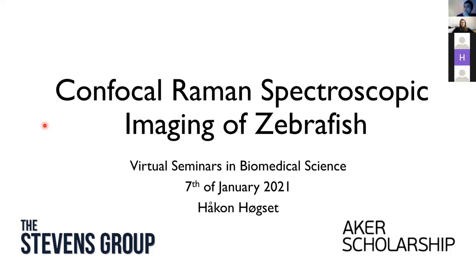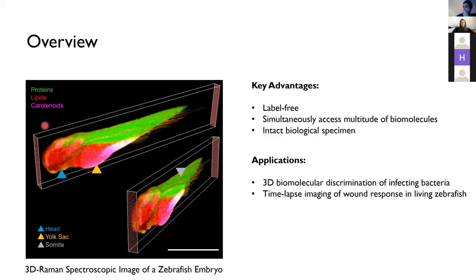And I will try to highlight some of the advantages of this methodology, namely that you can perform a label-free analysis and simultaneously access a wide array of different biomolecules and do this analysis in living and intact biological specimen. And I will demonstrate two applications that we developed in this work, where one is a three-dimensional biomolecular discrimination of infecting bacteria inside fish, and also time-lapse imaging of the wound response in living zebrafish embryos.